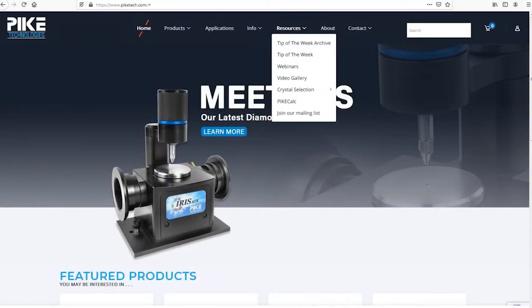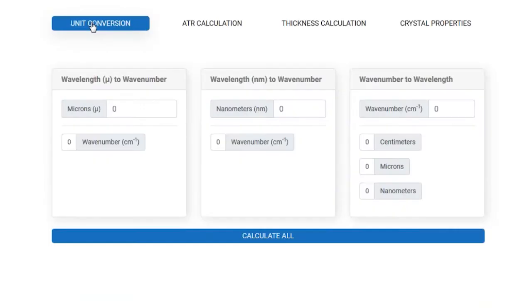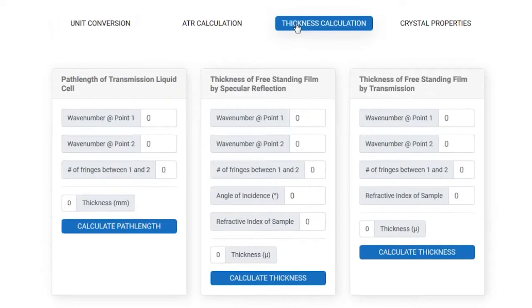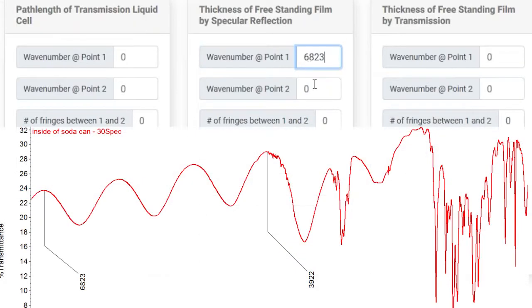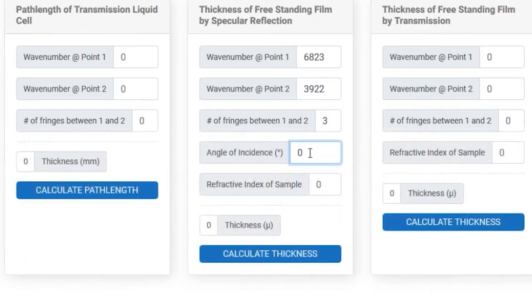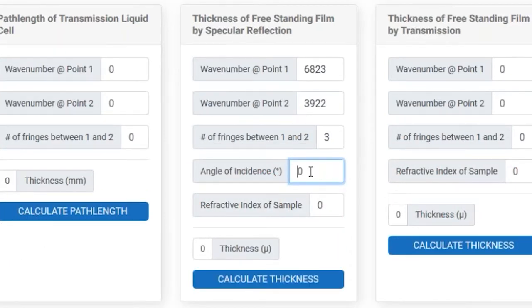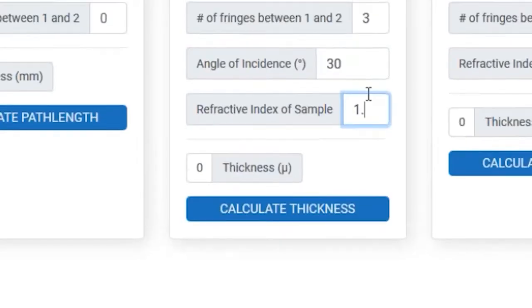Once you're in Pike Calc, go ahead and navigate to the thickness calculation tab and to the specular reflection thickness calculation. We'll enter our parameters and count down three fringes: 1, 2, 3. The accessory had an angle of incidence of 30 degrees and we'll assume a refractive index of 1.5.